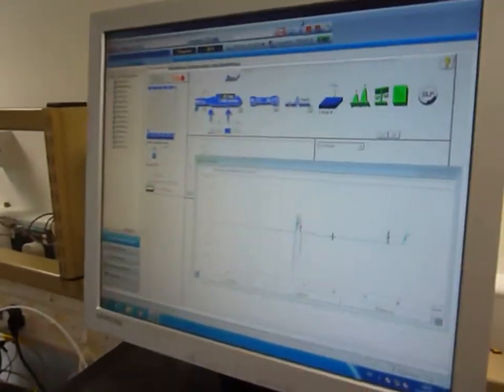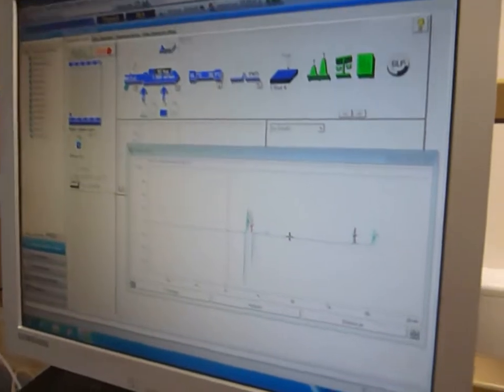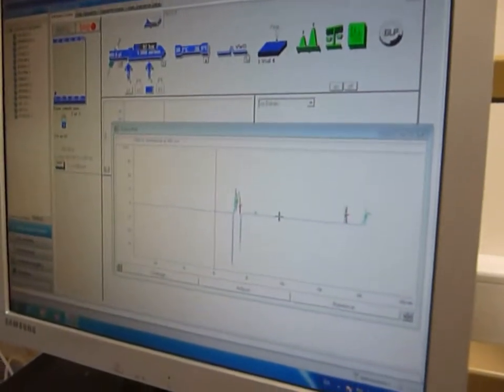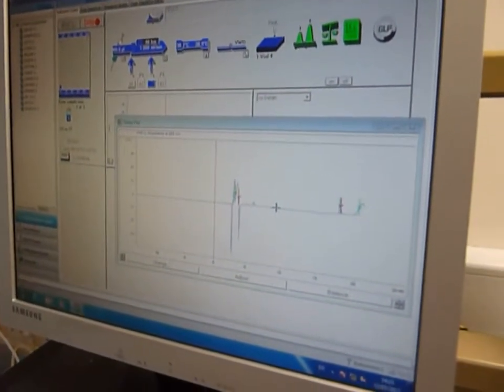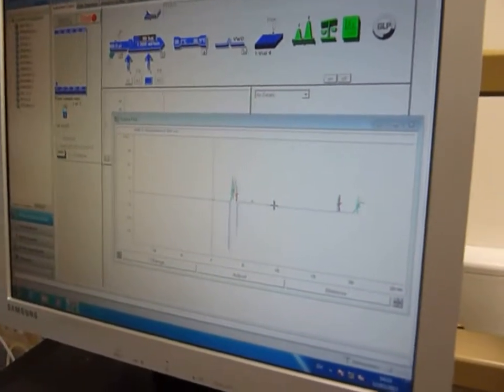So this is the peptide coming off now, as we speak, at 21 minutes.